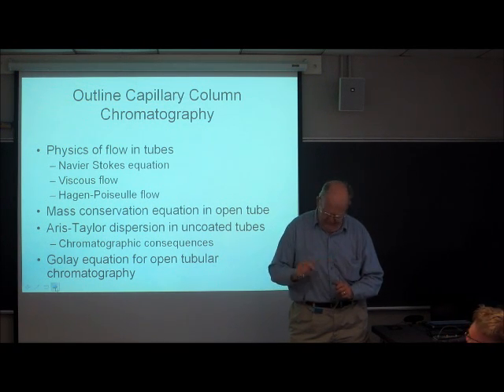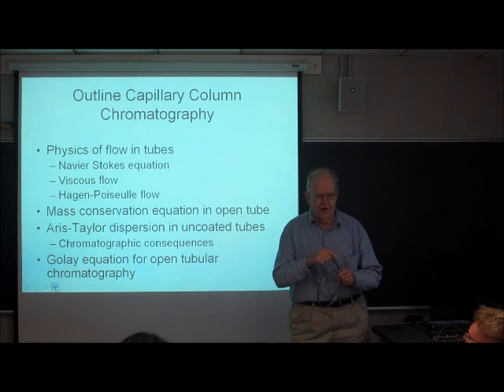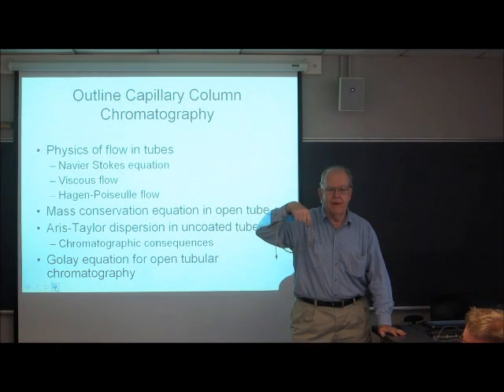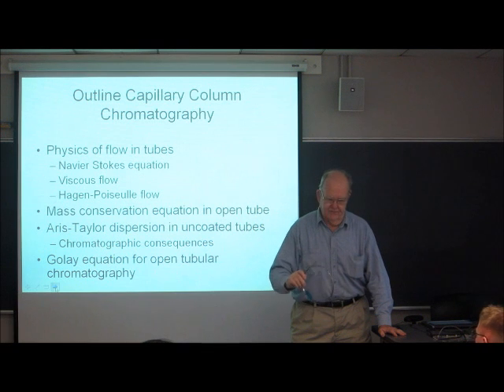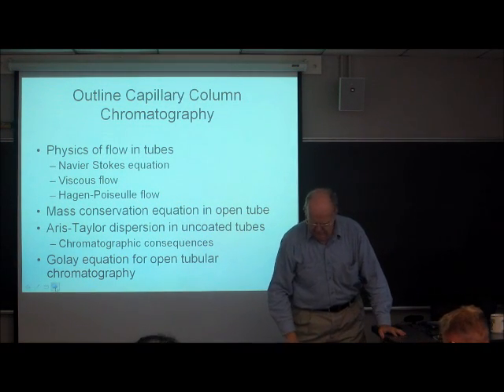If you look in this end without the yellow thing, you'll see some stuff. That stuff is actually a little bit of glass wool that keeps the particles that are packed in the column so that when you turn it over, they don't spill out. It won't hurt you, but you don't want to lose them.